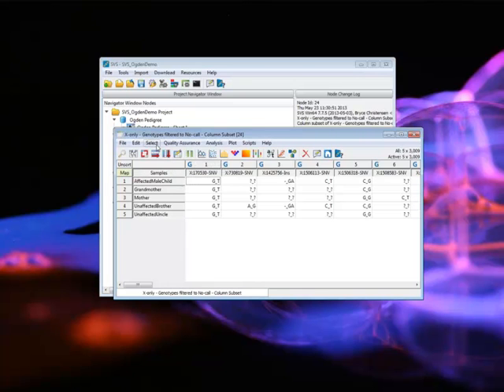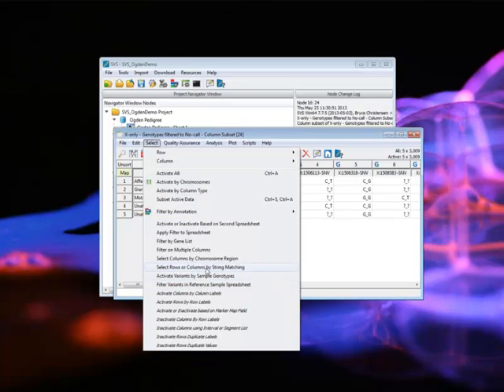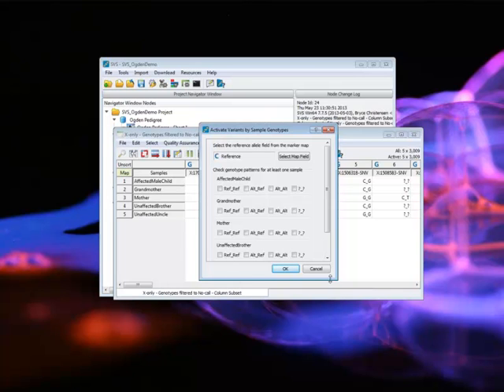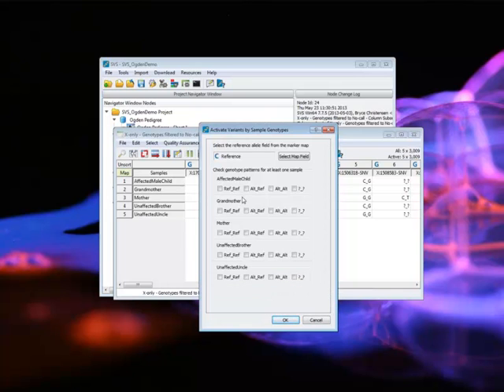Well, to begin with, we know it's X-linked, so let's set a filter here based on X-linked status. There's a few ways to do it, but I'll use a really simple one here, which is, where did it go? Activate by sample genotypes. This is just a really simple little tool that lets me specify the exact zygosity state I'm looking for with each sample. So I'm looking for the affected male child to be homozygous for an alternate allele. It is X chromosome. Technically there's only one copy, but it's always coded as diploid here.